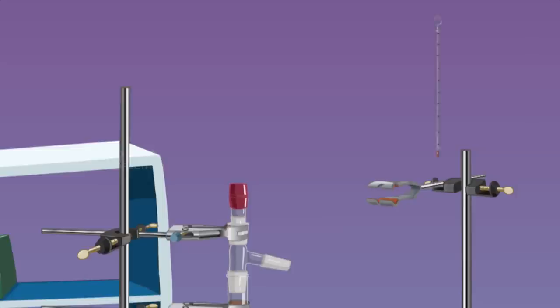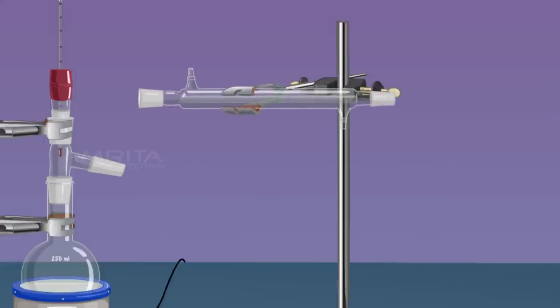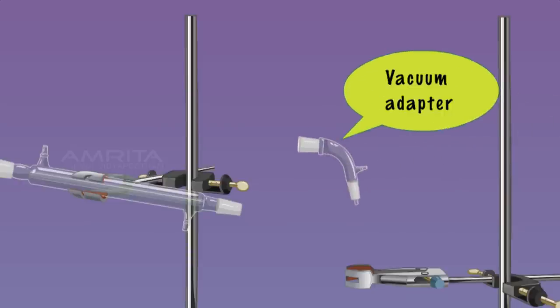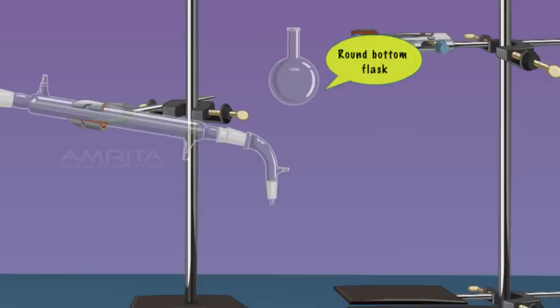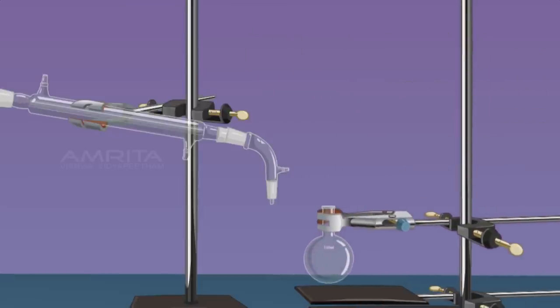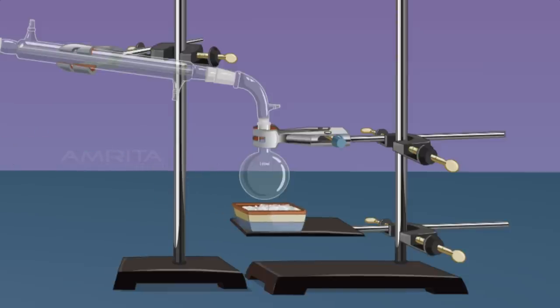Insert a thermometer through the thermometer adapter. Connect a water condenser to the outlet of the distilling head. Connect a vacuum adapter to the water condenser. Connect a 100 ml RB flask or receiver flask to the vacuum adapter. Take an ice bath and place the RB flask in the ice bath.